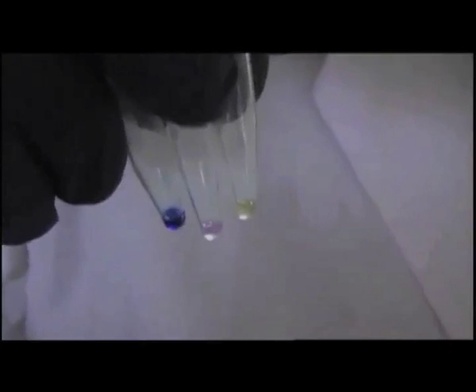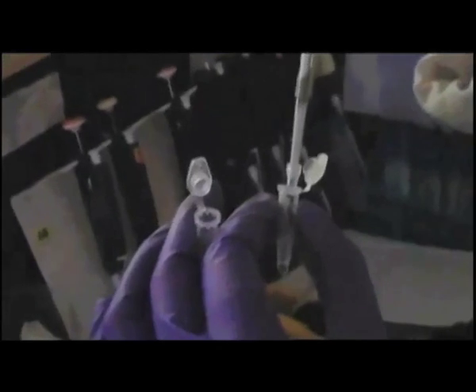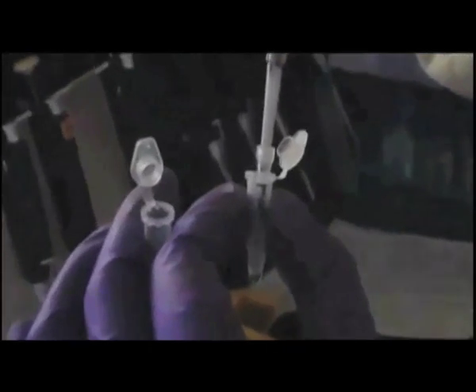Here you can see all the 3 Cy dyes in different tubes. After addition of Cy dyes, the sample will be incubated on ice for 30 minutes in the dark. The labeling reaction will be stopped by addition of 10 millimolar lysine, followed by incubation on ice for an additional 10 minutes.